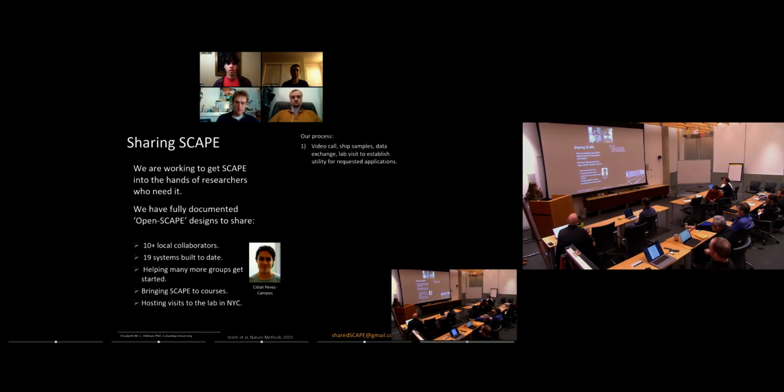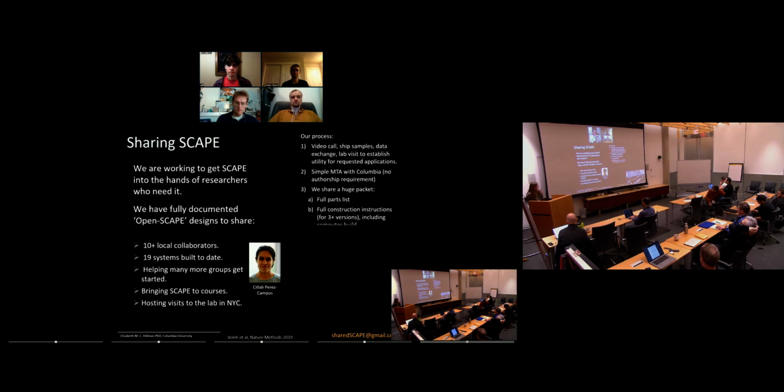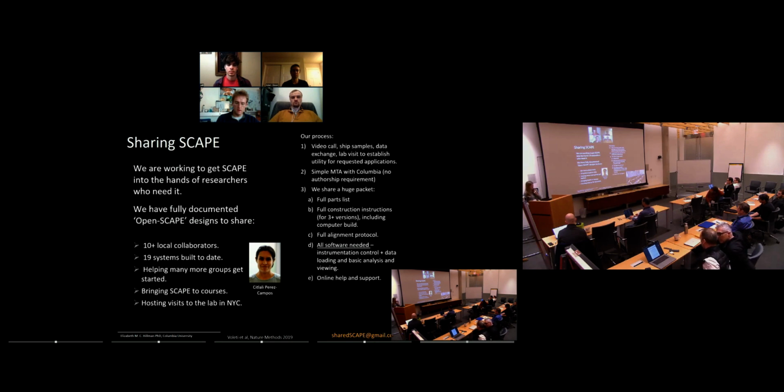The process that we go through is we do a lot of work initially with people to get them to understand what SCAPE can do, to check that what they want to do is going to be compatible, which means them sending us samples or coming to try it. We do an MTA because we want to share all of this information, but it's a very simple thing just to set things up. Then our packet includes a full parts list, complete construction instructions, including how to build the computer, how to do all the alignment, and we provide all of the software that they need, from instrument control to data loading and basic analysis and viewing, and then we help them online, which is again Lali's magical skill.